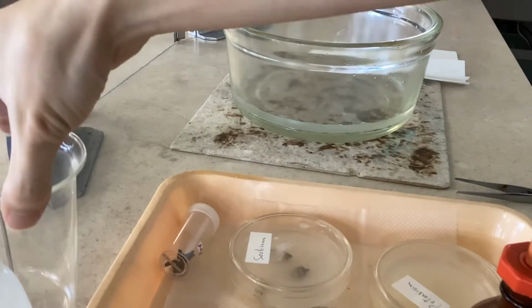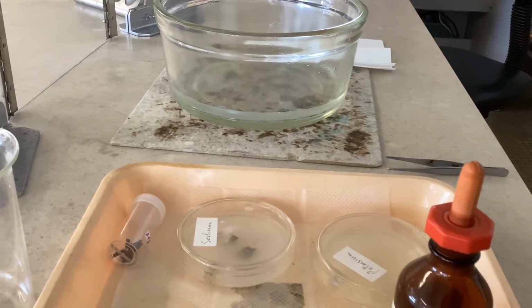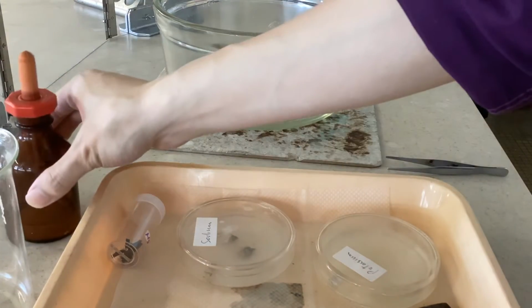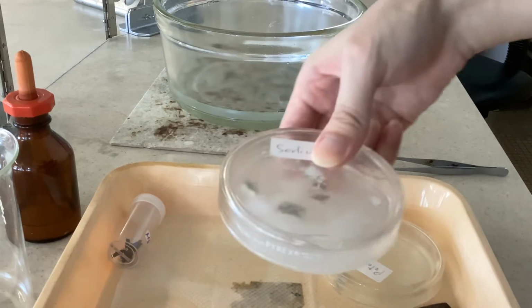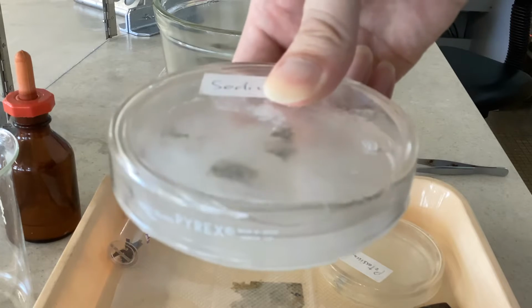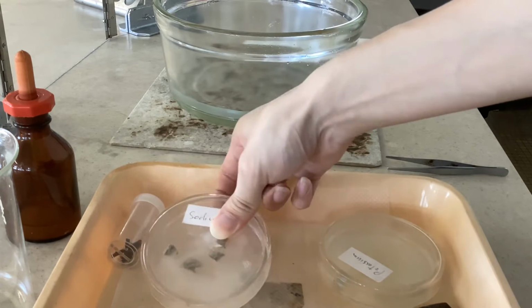Can you see that there are two colorless trays, one with label sodium and the other with label potassium? And then have a closer look at it. Can you see that they are immersed in some oil? We call it paraffin oil.